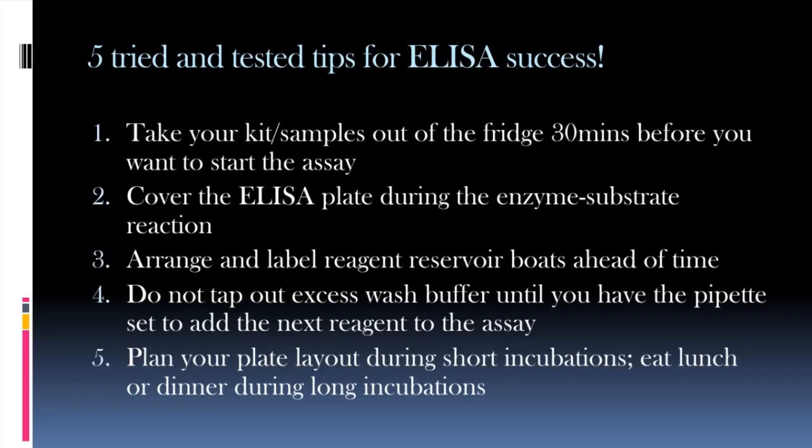So this is a fairly short procedure. It takes maybe a day or 2 days to get values for many samples, but it does take a couple of hours at a time. And so you want to fit in lunch or dinner during the longer incubations that are an hour or 2 hours long.